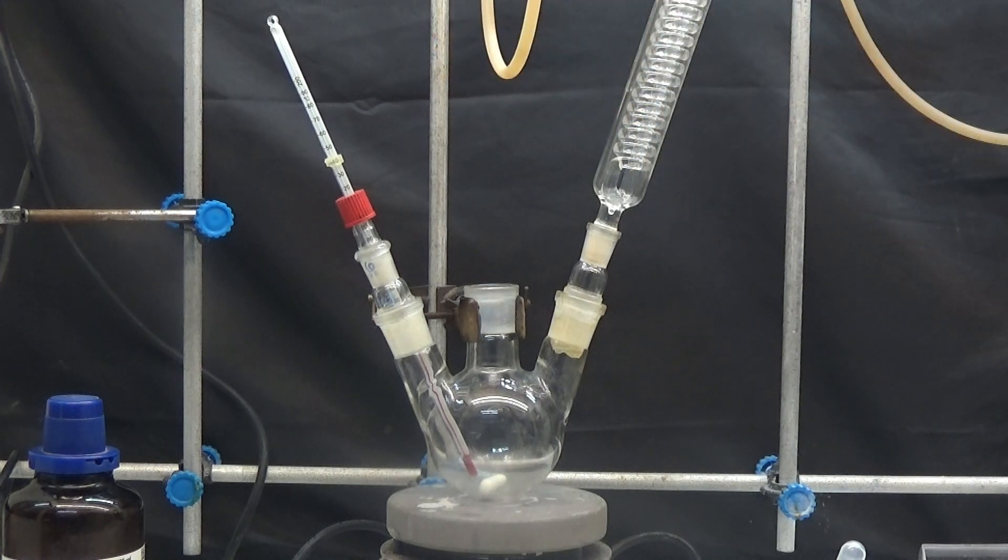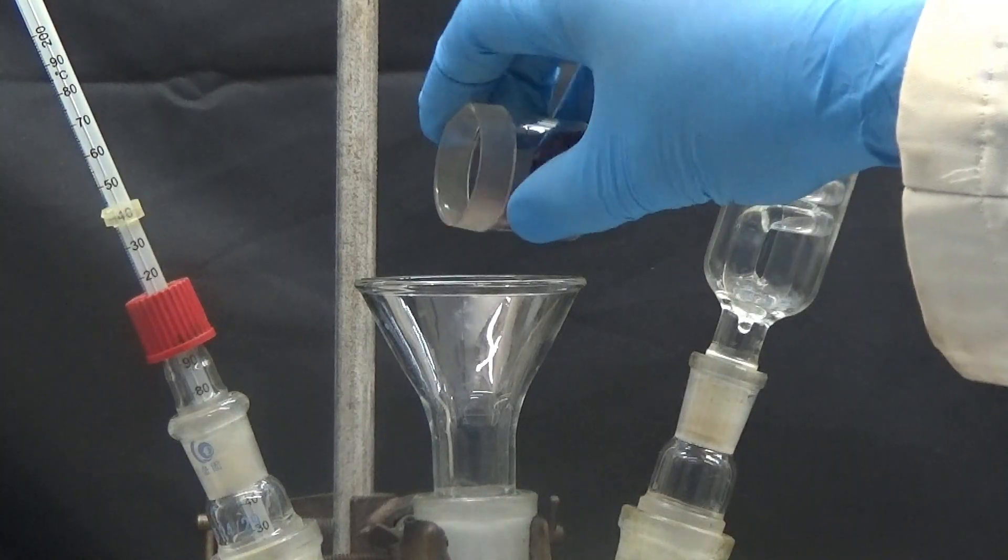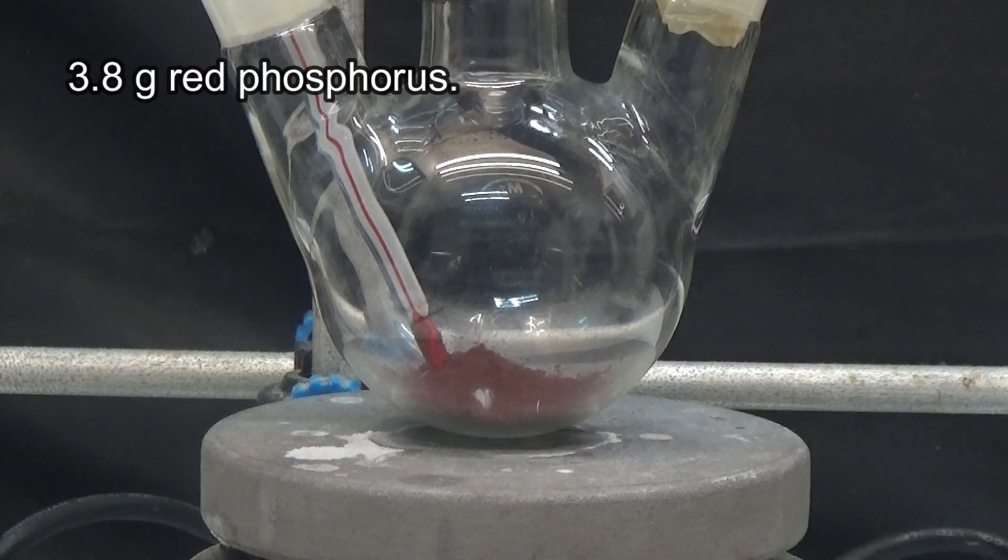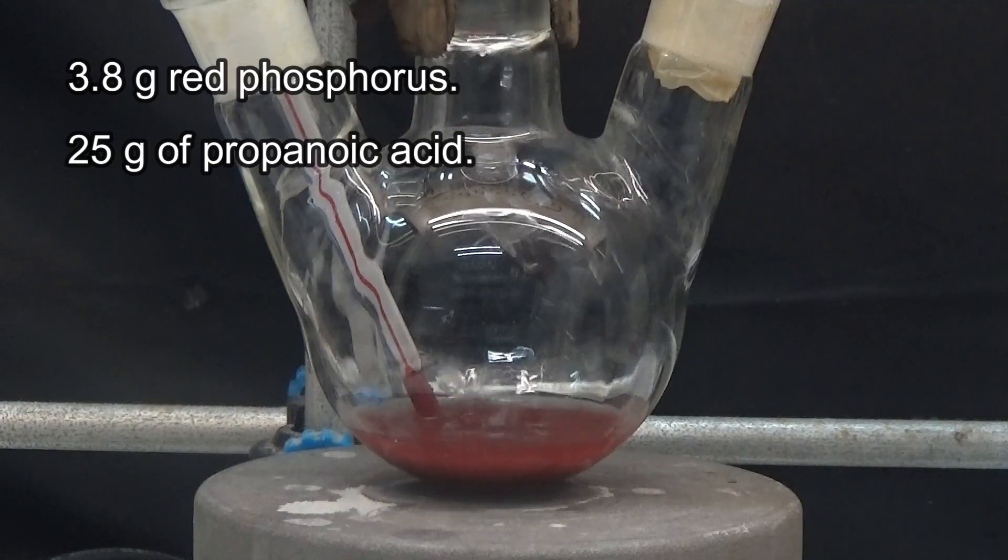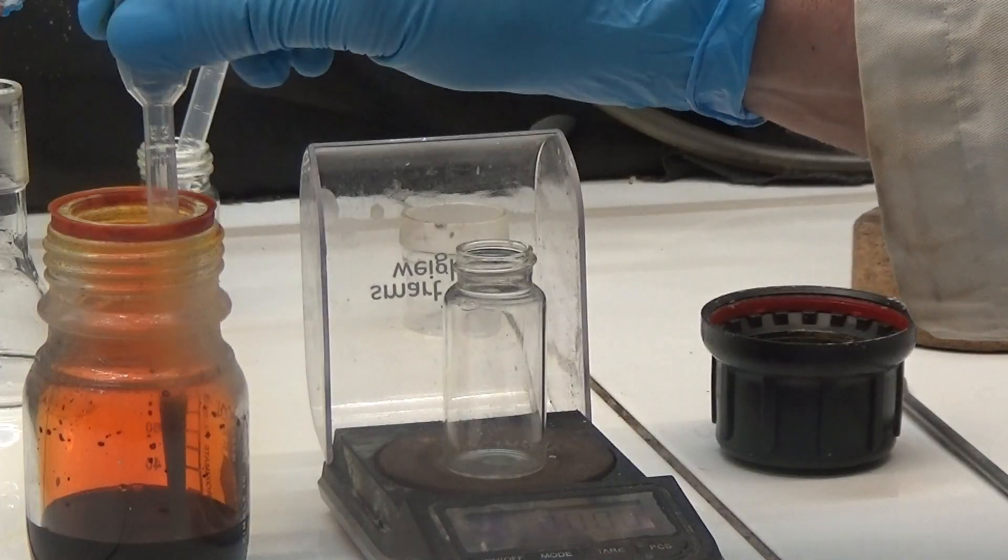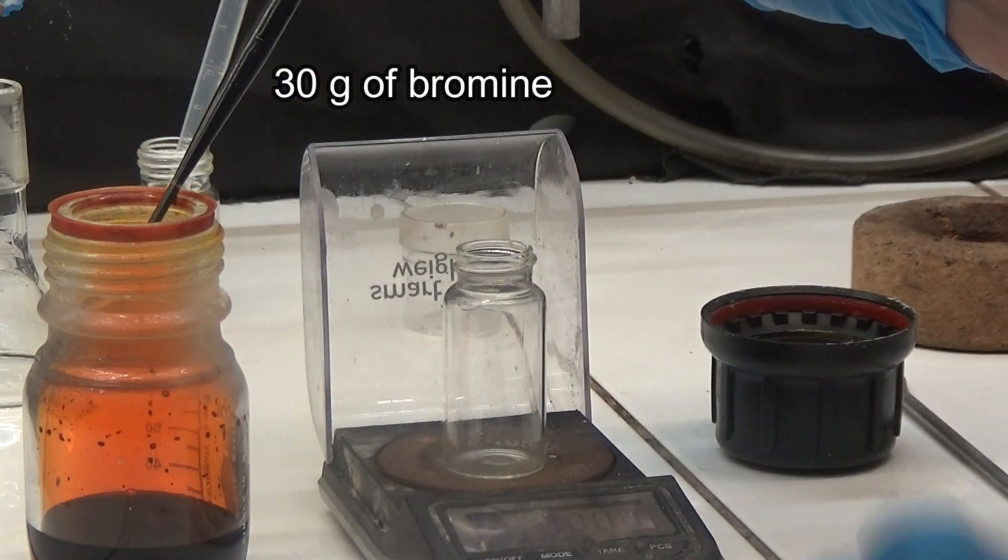A 250 ml flask was used with a thermometer, reflux condenser, and a pressure-equalizing funnel. In the flask, we put 3.8 grams red phosphorus, 25 grams of propanoic acid, and weigh 30 grams of bromine under a fume hood, taking care not to inhale and not to spill it.